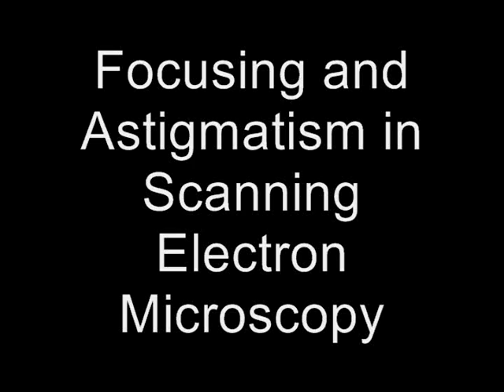Today, we are going to tell you about focusing and removing astigmatism from the primary beam of a scanning electron microscope. Learning these techniques will allow you to obtain the clearest images possible from the SEM. First we will talk about focusing the SEM, after that we will talk about astigmatism.